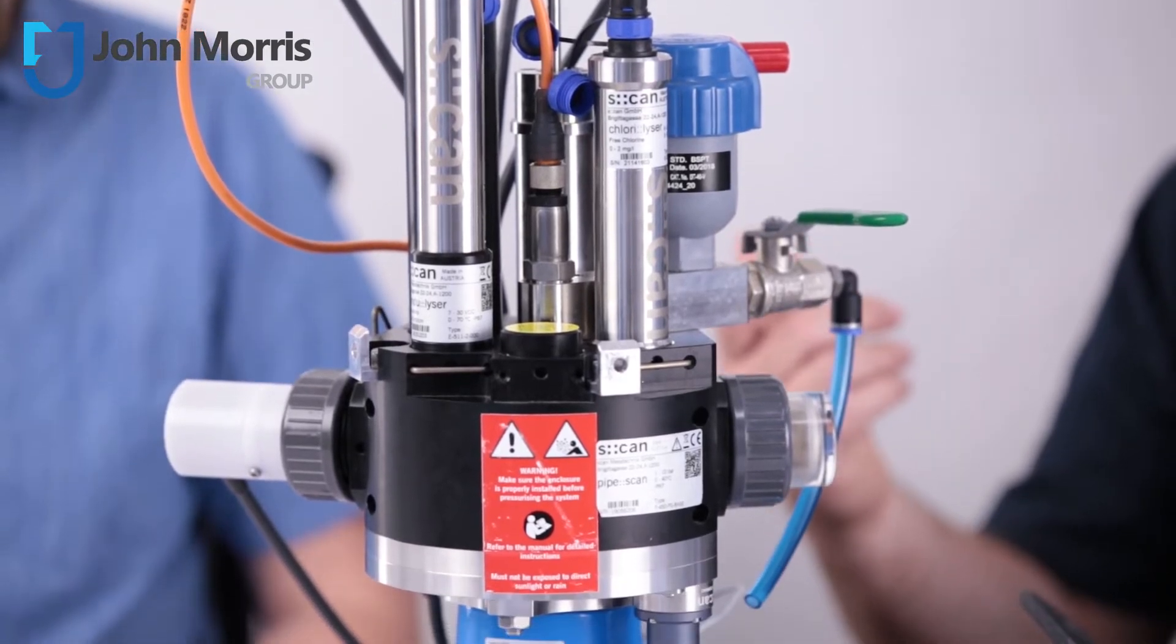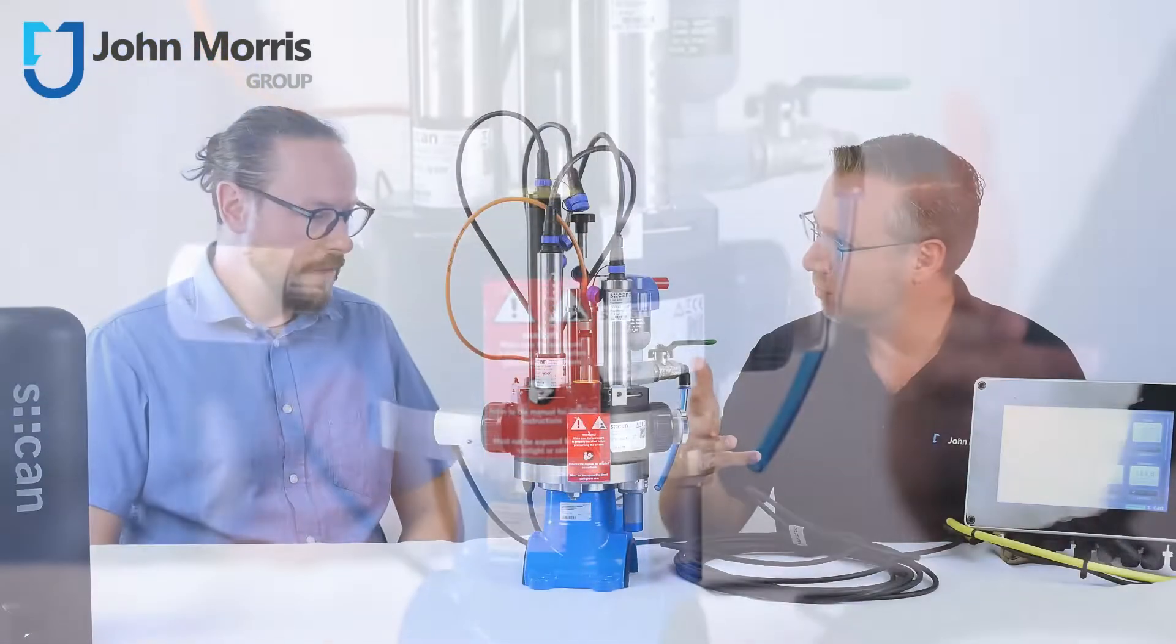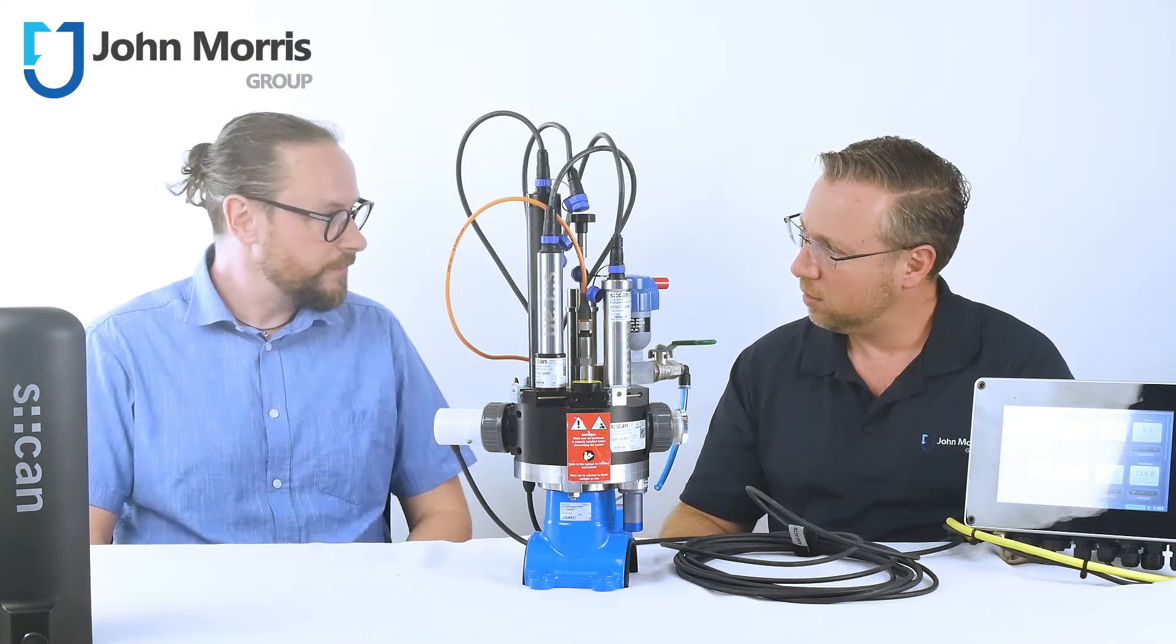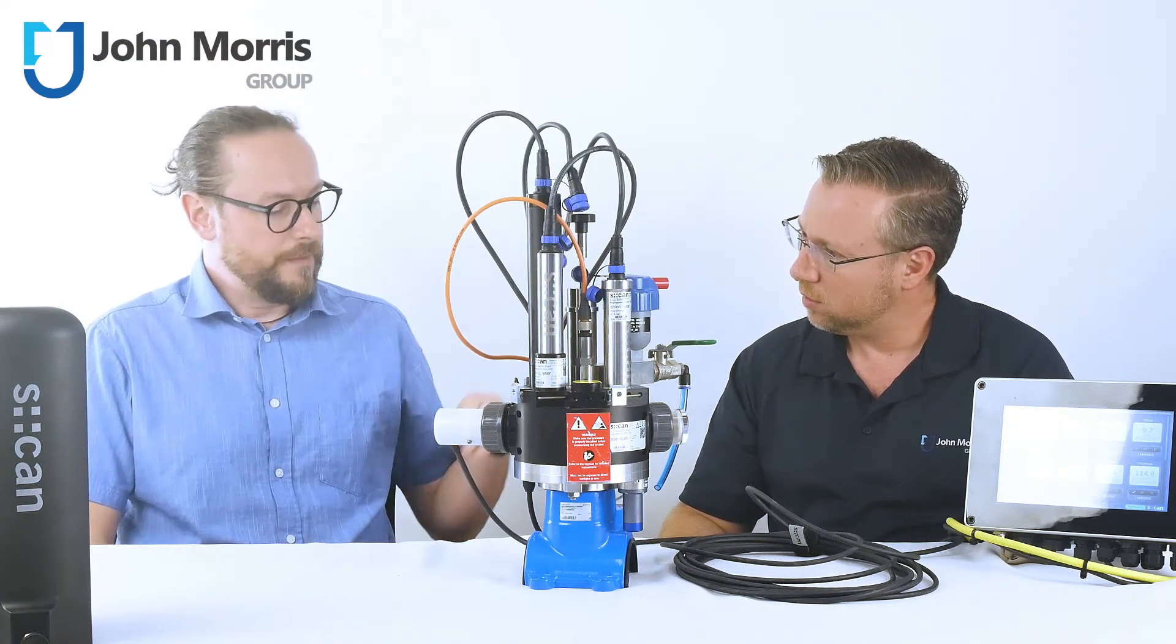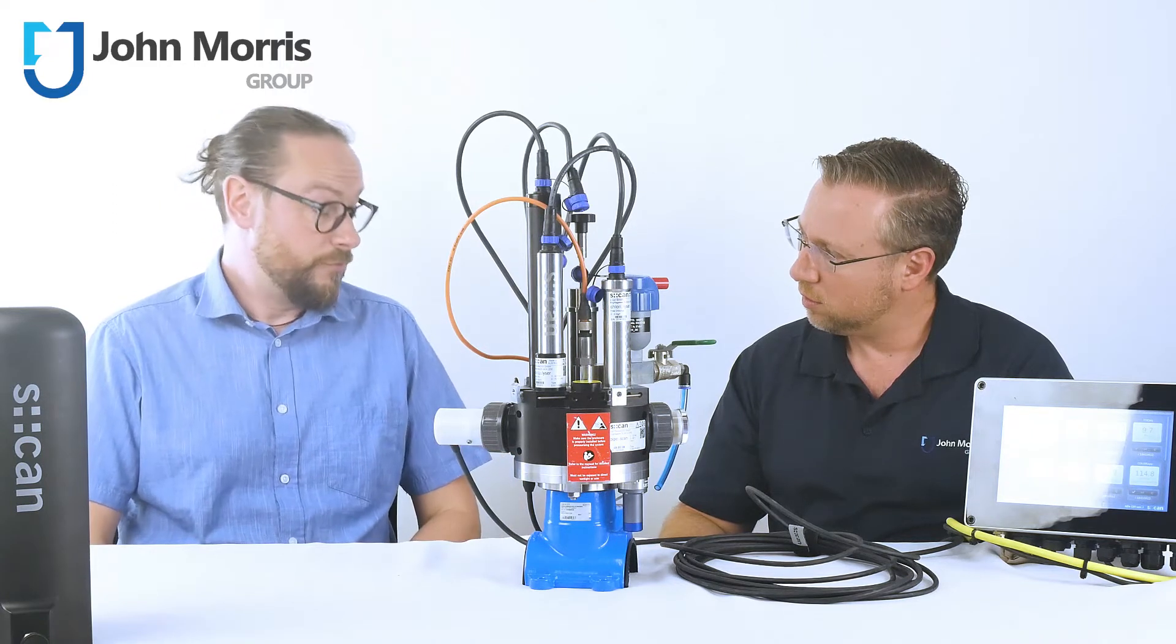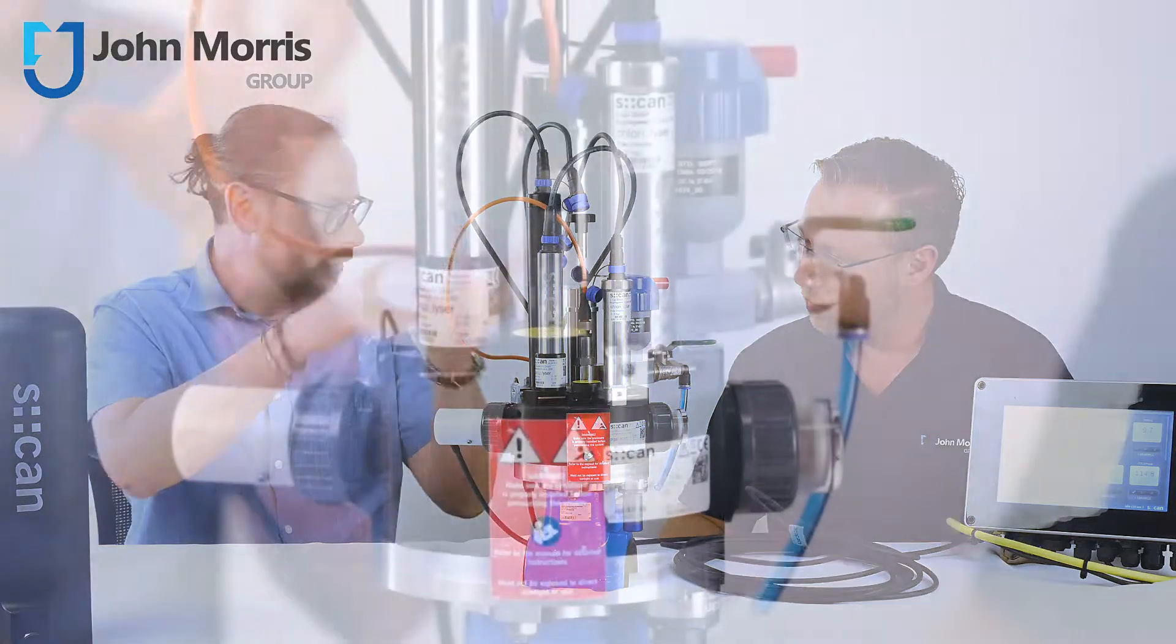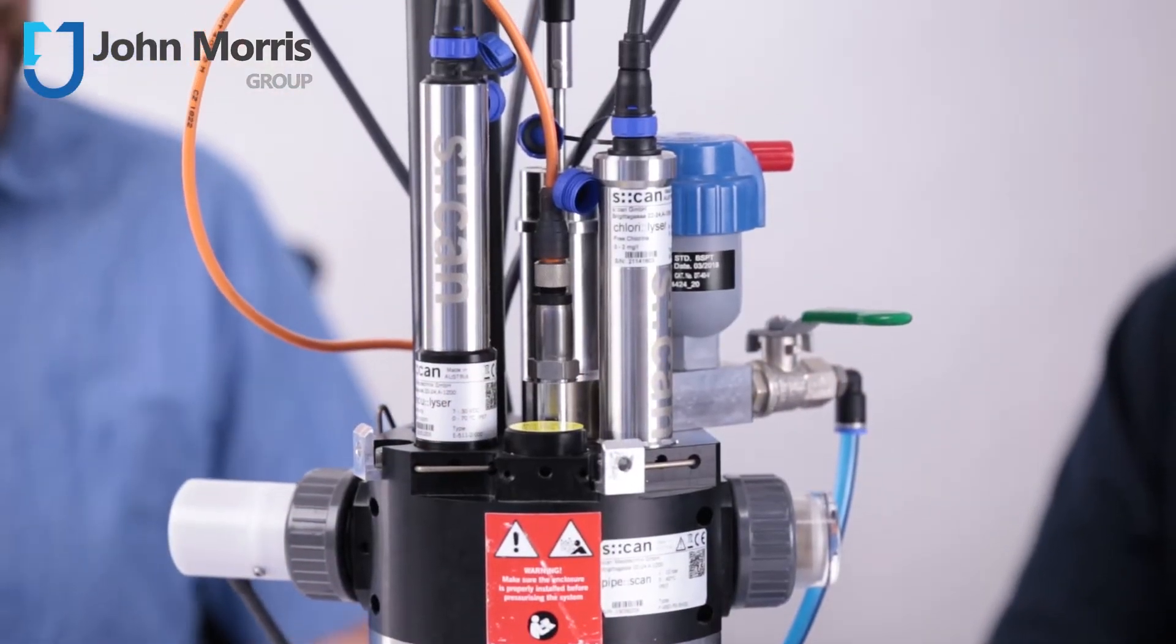Right, and do you have to turn the water network off while you install it? No, actually you can install it in operation. So you put the clamp saddle, then you can drill a hole in the pipe, and then you separate the unit from the pipe, you can do all the installations, and then you're running in a hot tap.